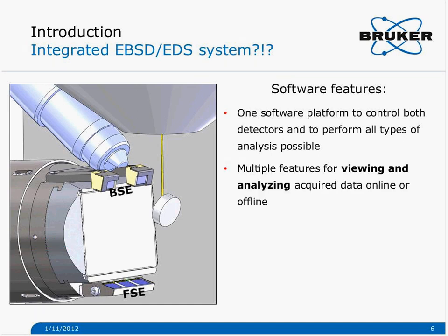The software will have to have multiple features for viewing the results during the analysis, while they are acquired, but also to analyze and interpret the results either online during the analysis or offline after the measurement is done and we reload the data set.